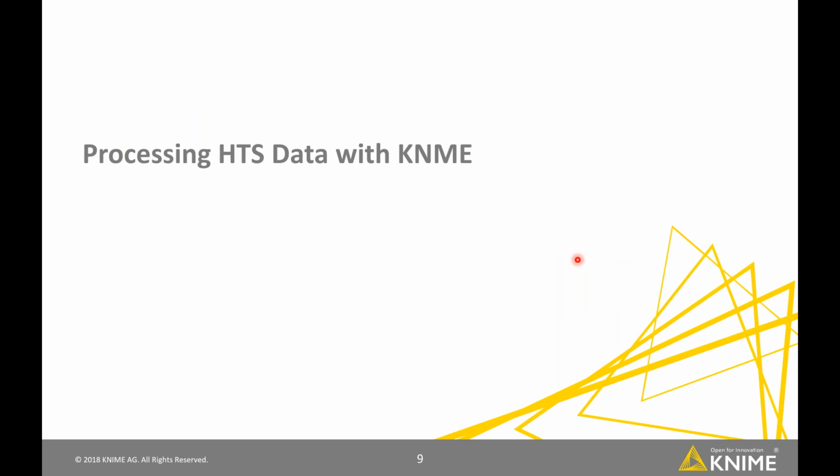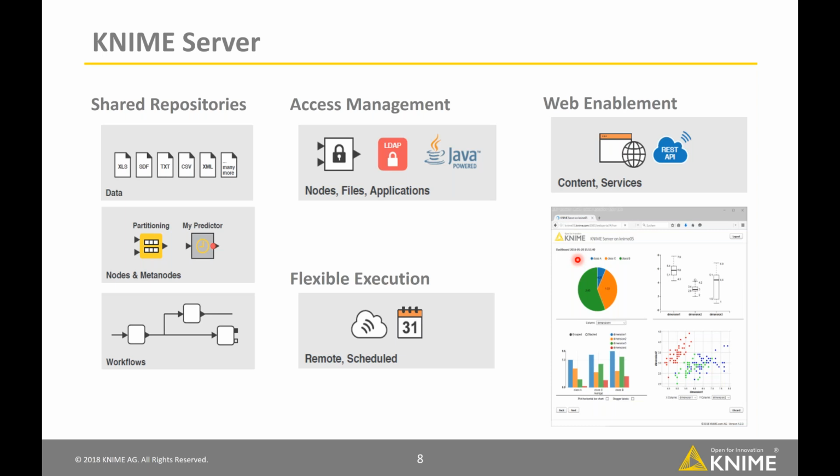Okay, that was my introduction to Knime. Let's move on to talk about processing HTS data. Oops, sorry, wrong way.